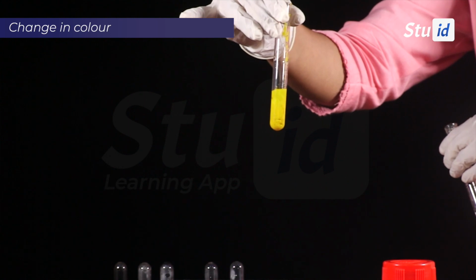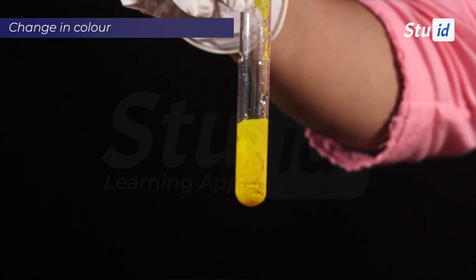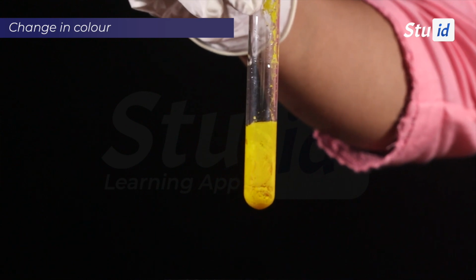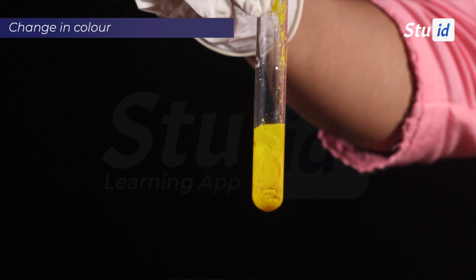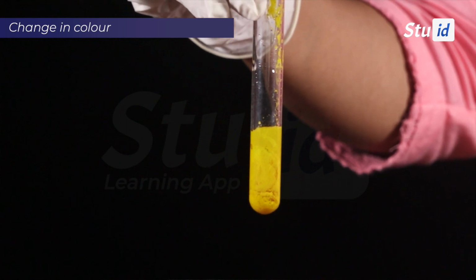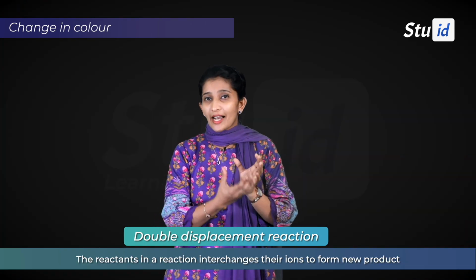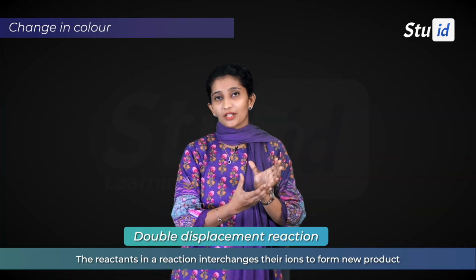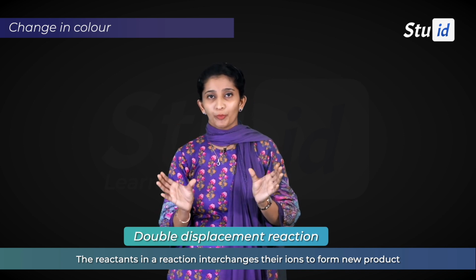Now we can conclude that this change in color has occurred due to a chemical reaction which has taken place between lead nitrate and potassium iodide. This reaction is also called a double displacement reaction. Why? Because the reactants in this reaction are interchanging their ions to form a new product.